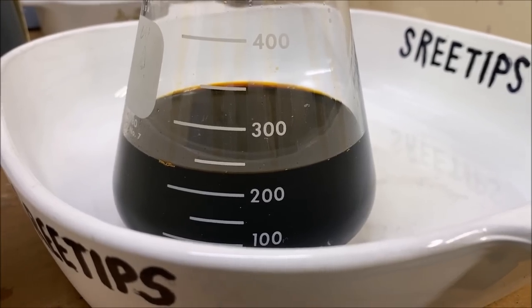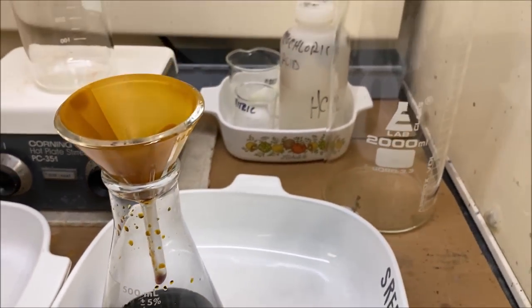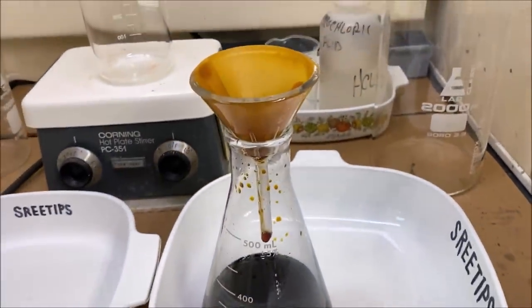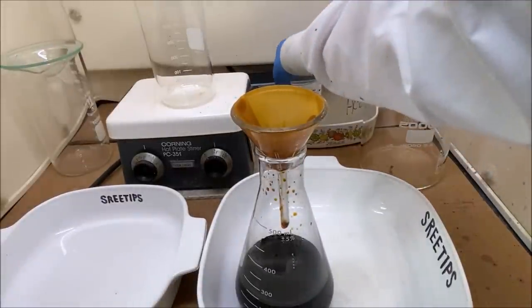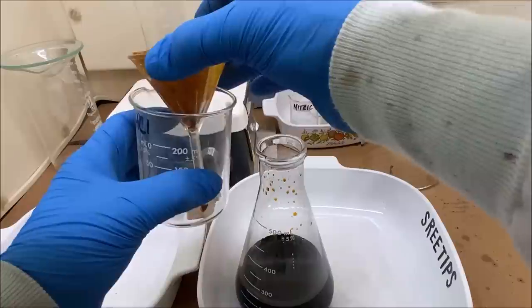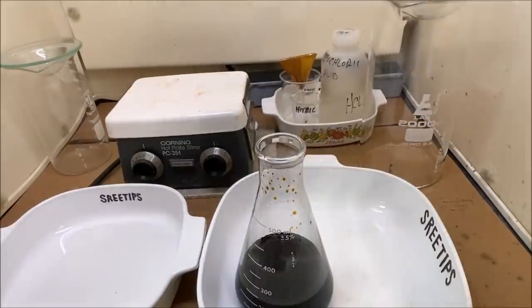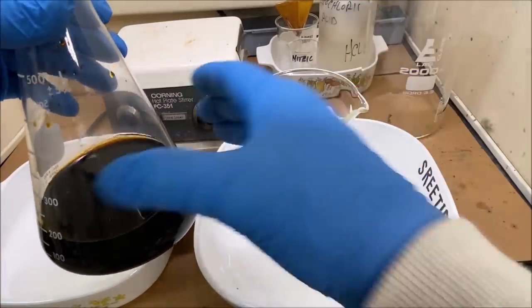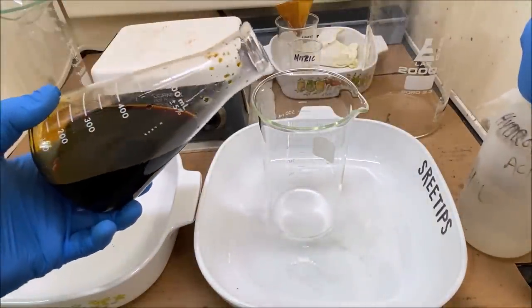This is pretty close to the right concentration that we need to do the precipitation. We need about 20 milliliters per gram of material. So what we're going to do now is I'm going to take this funnel out of here. Pretty much got all this out of here. Set it back up out of the way. Now what we'll do is we'll transfer our platinum solution into a clean beaker. Use hydrochloric acid.